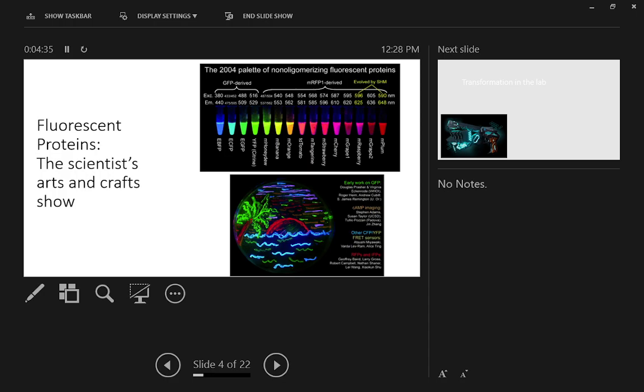And if we want to locate one or more proteins, we use different types of fluorescent colors, wavelengths, that let us visualize it easier. And the really tricky part, the actually really interesting part, is a lot of these are basically all very, very similar proteins with small modifications to them that create a slight variation of color.